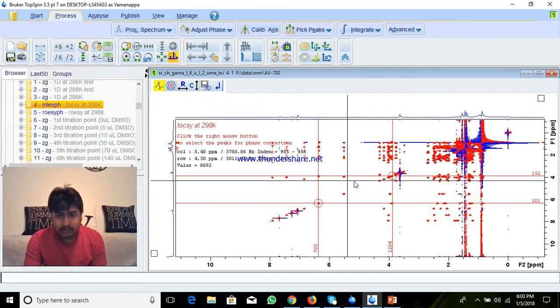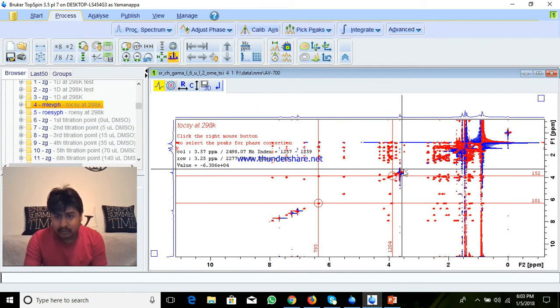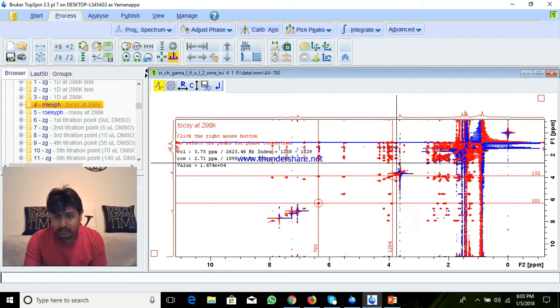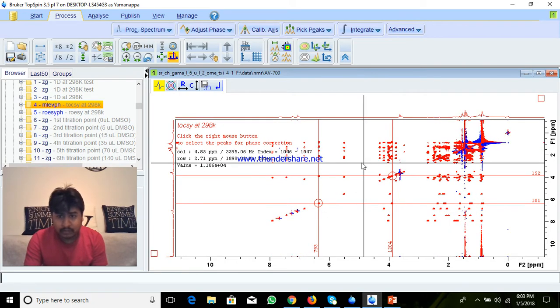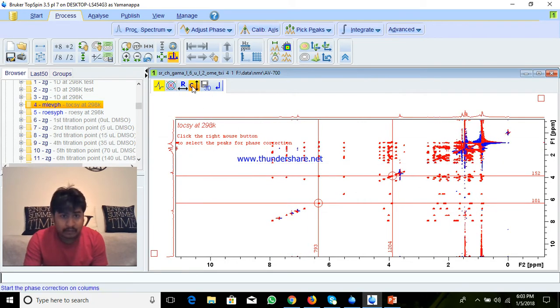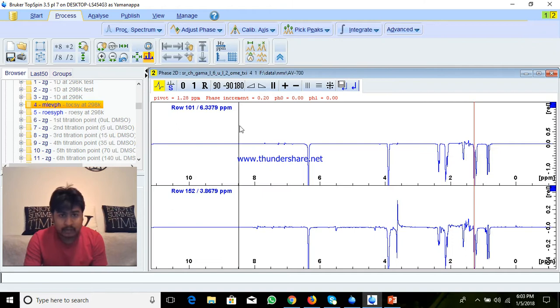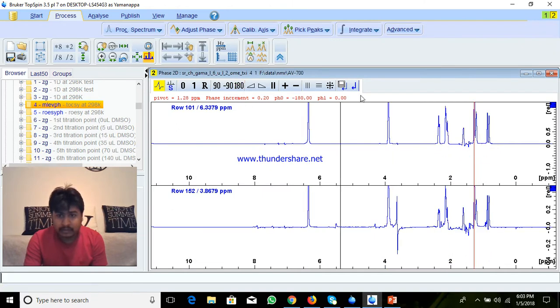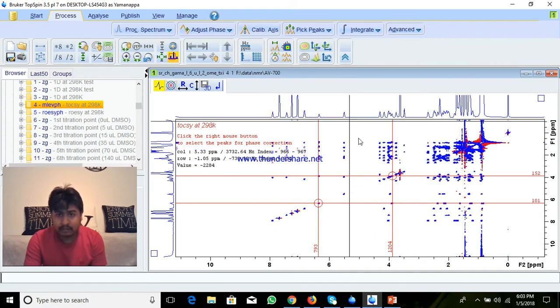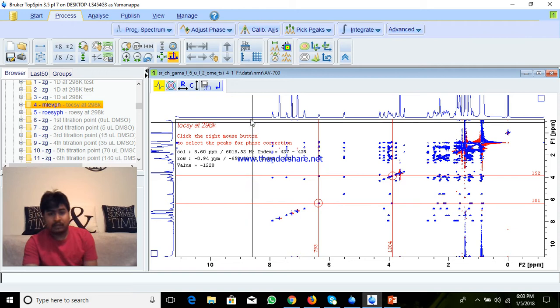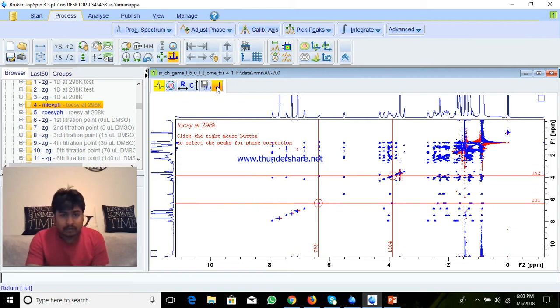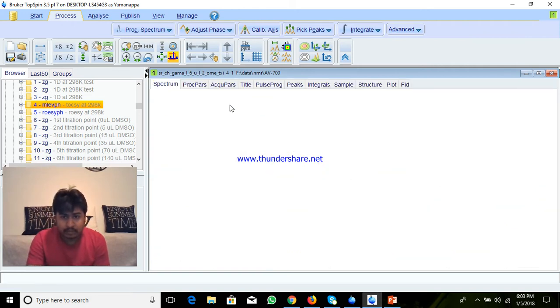Actually you can see that there is a red color. What I will do is I will go here and tilt 180 degrees. Now we will get positive — it was negative — then go back.